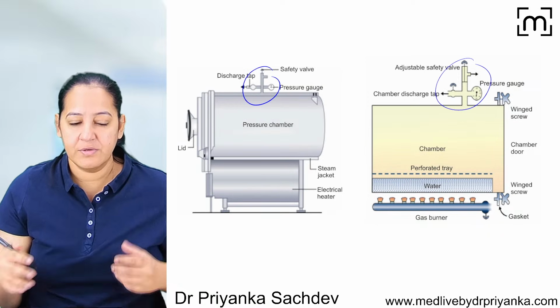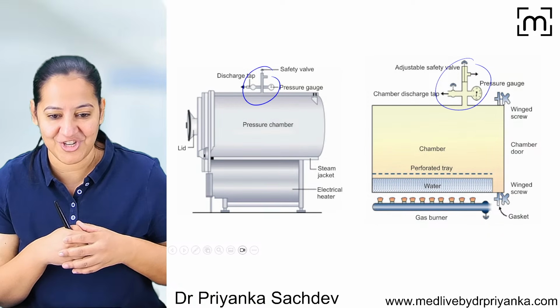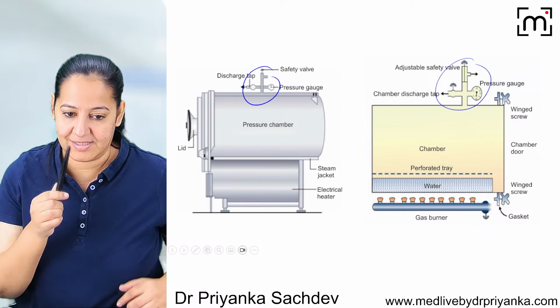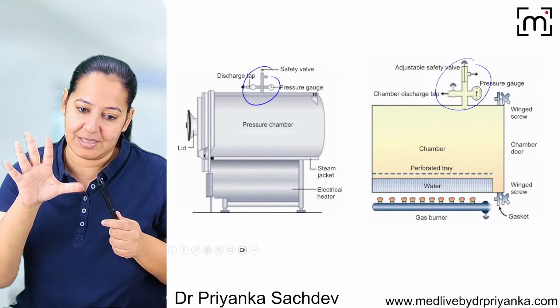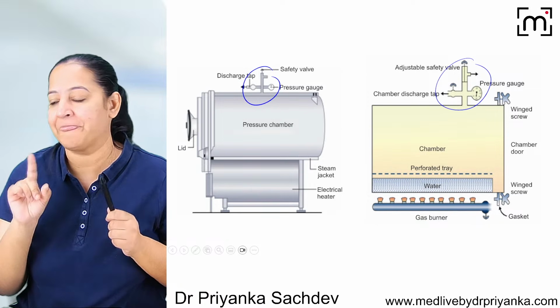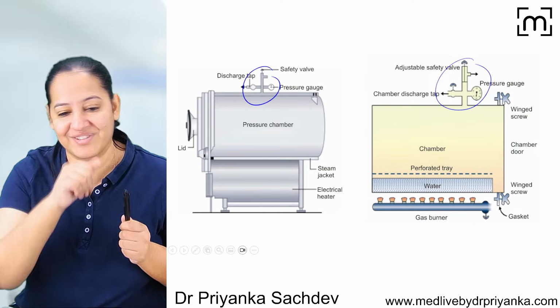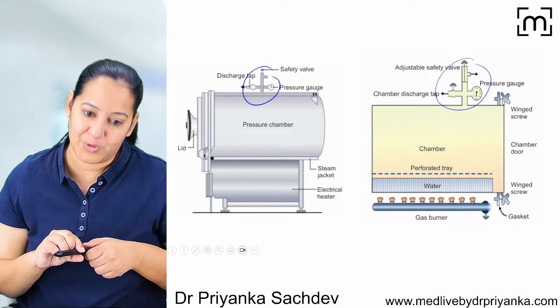You can see here. So you will say, what is the funda here? Why are we using a pressure cooker? To sterilize the objects. For example, this is my article and I want to sterilize it. Again, the article has 5 things. The first 4 things are not giving any trouble. Bacteria, virus, fungus and parasite, you can easily kill them, but the 5th one, the spores, are resistant. Now I want to kill the spores also.